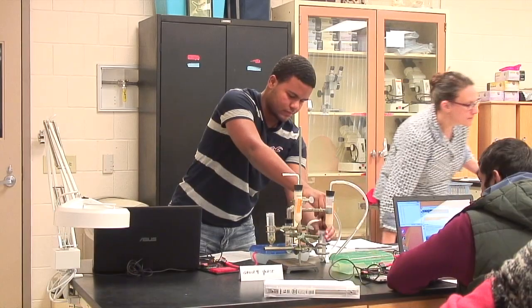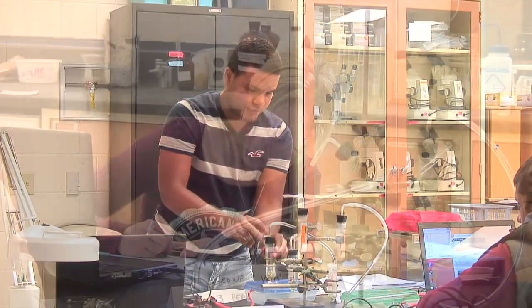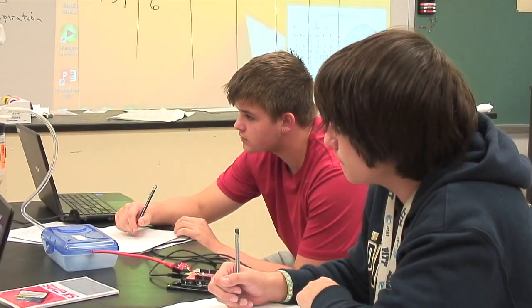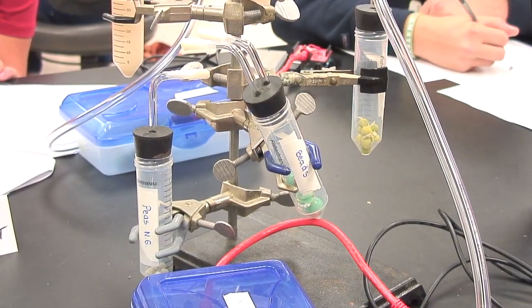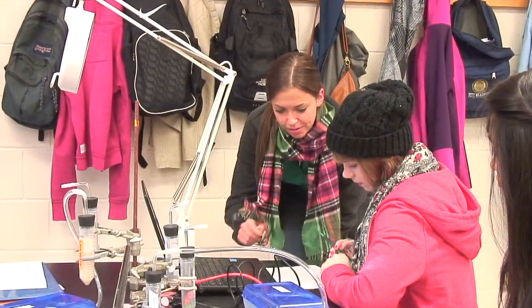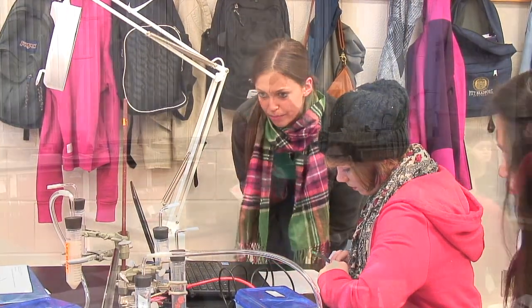The STEM Sense project is really about showing students that they have the capability not only to make measurements that inform the scientific process, but they can design the systems and alter the systems that make the measurements. The STEM Sense labs lend themselves to inquiry and research-based learning, so students use the Arduino microcontroller and the K30 sensor to measure respiration output of peas and yeast, but by providing other study organisms or access to supplies that could change respiration rates, students can do their own research on respiration.